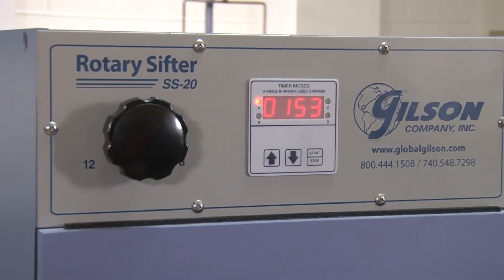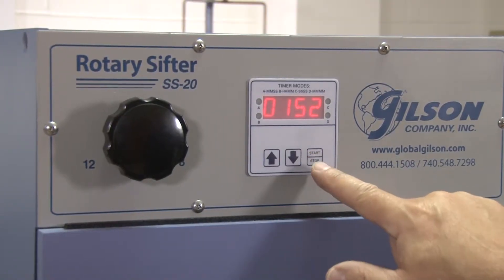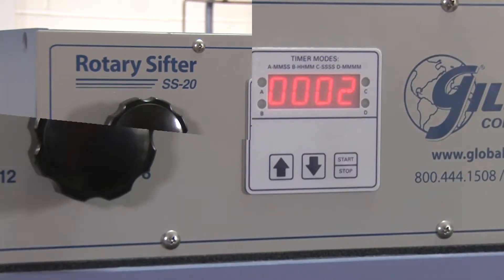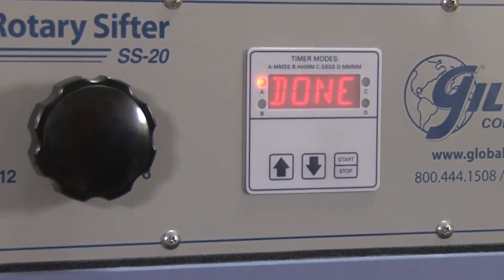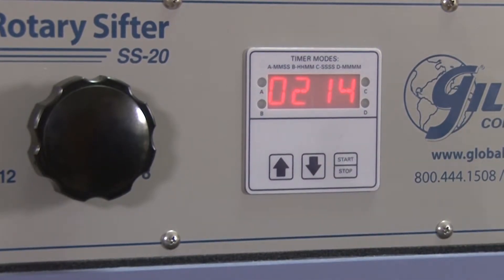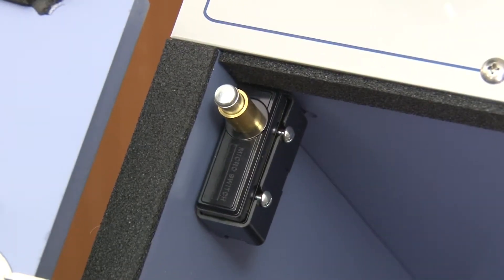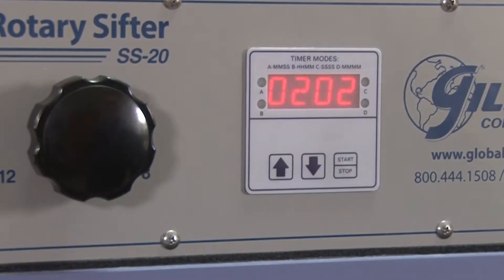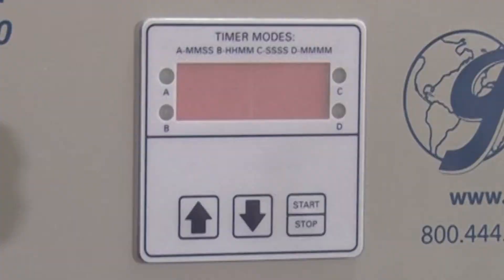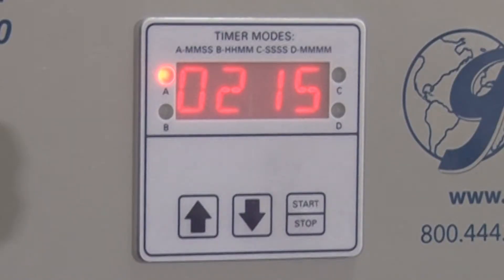The digital timer features a large LED display and a mid-cycle pause function. Once the cycle is completed, the timer will automatically reset to the desired test time. For added protection, a safety switch shuts off all power when the door is open and resets the timer to its desired test time once the door is closed.